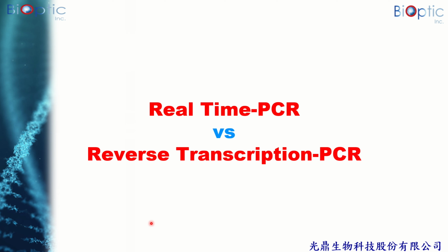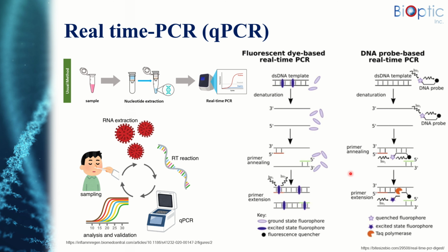Since PCR technology has been developed for decades, there are also many extended applications and transformations. Here, I will introduce two technologies that are more related to today's topic. One is real-time PCR, and the other one is reverse transcription PCR. The two of them are often confused just because the abbreviations are both RT-PCR. Let's see what's the difference.